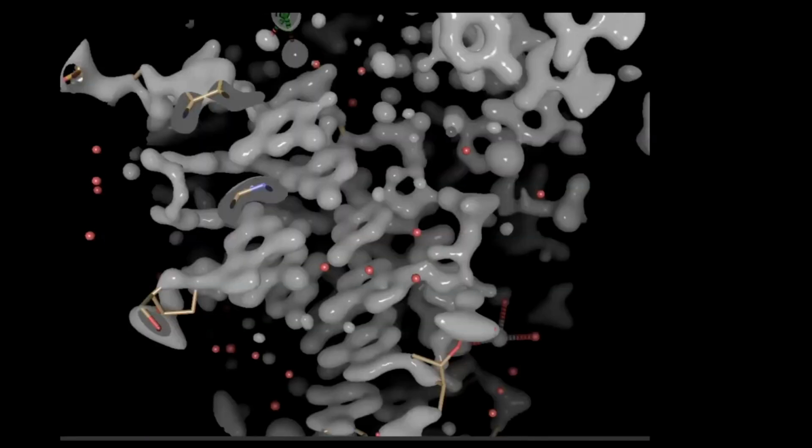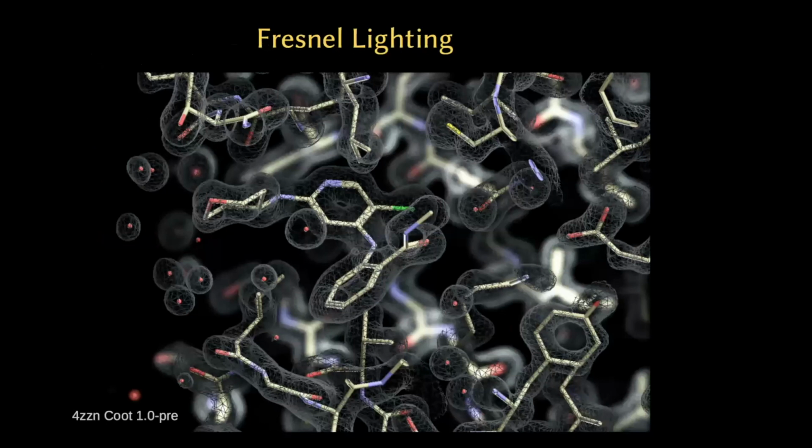So I mentioned that we can change the material properties, and here's a piece of DNA. Obviously the resolution's higher, and you can see that it's got some specularity here, so it's kind of shiny, a sort of shiny wax effect by changing the material properties. What else do we have? We can do 3-point studio lighting.